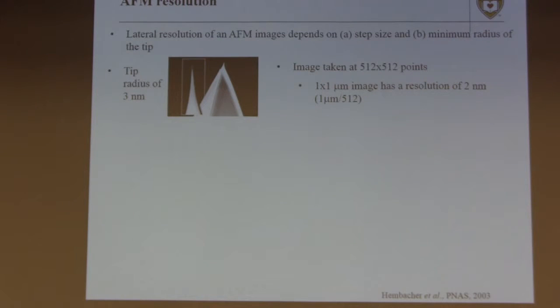First of all, you have to have a very, very sharp tip. To a first approximation, the sharpness of your tip will determine your resolution. Tip radii are typically about 10 nanometers, though you don't really know what it is; you need to stick it under the microscope to see the apex. They approach 3 nanometers. They have fancy things now glued to those, such as carbon nanotubes and so on, so they mess with the resolution. But it's approaching a nanometer or so. It's not the only thing that matters.